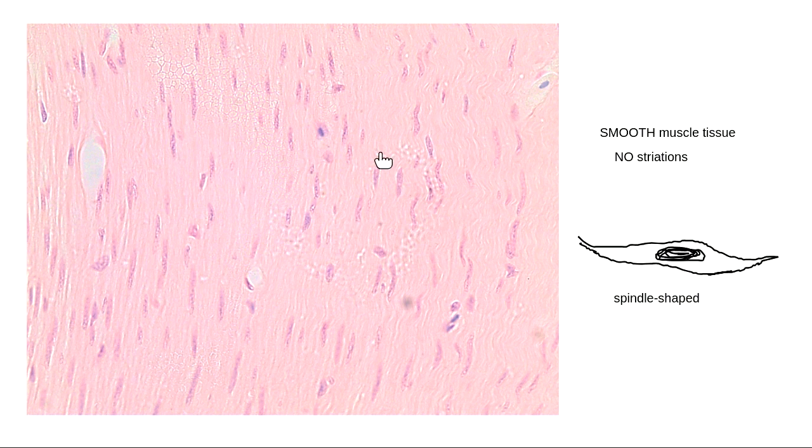So you look at smooth muscle tissue and you see these large nuclei, and then you probably can't see much of anything else. I mean, we can kind of see a little bit of a wavy pattern from where it's squeezed together, but what we definitely don't see is alternating light and dark, light and dark. We don't see those striations. When we look at smooth muscle tissue, your big tip-off is we're looking for these big nuclei that we see inside here, and we don't have those stripes. That's how we tell the difference between them.